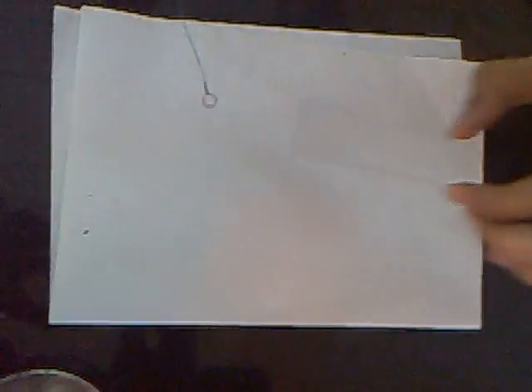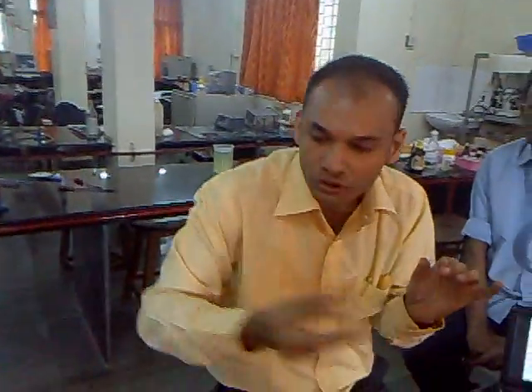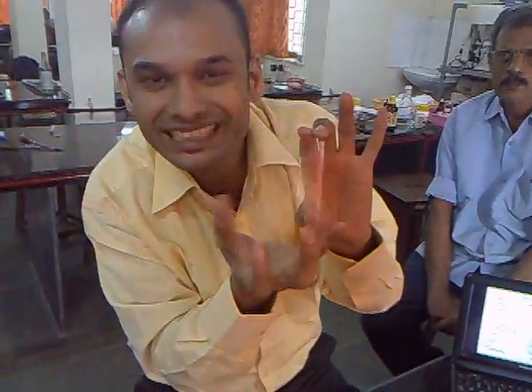If you observe this, you will see a very thin smear is created — a thin layer is created. You have to use the loop in a circular pathway. Now I have to place this for the air drying procedure. This particular smear has to be dried. I want you to focus on the periphery, the sides of the smear. If you focus on the side of the smear, it is getting dried, but the central part is still not dried. The central portion has to be dried the same way as the periphery. We stop for some period of time and let this particular sample get dried.